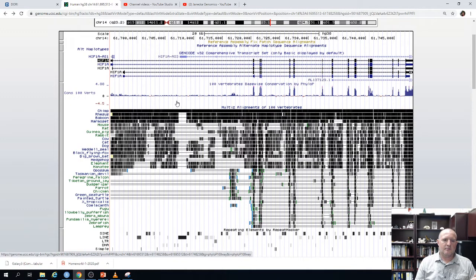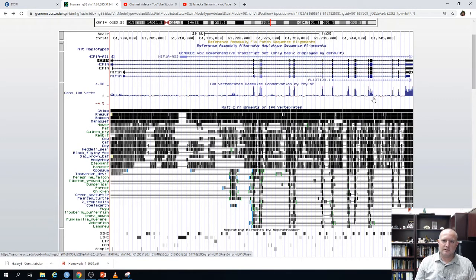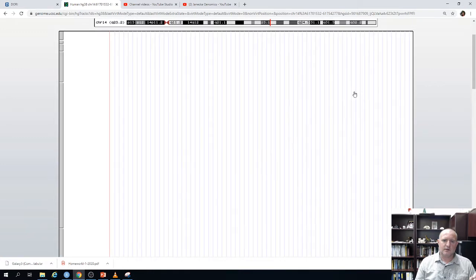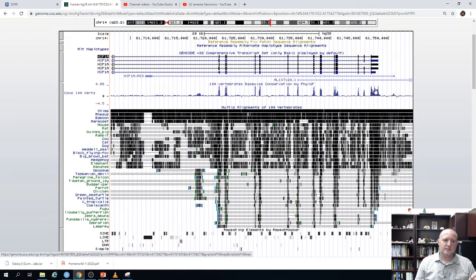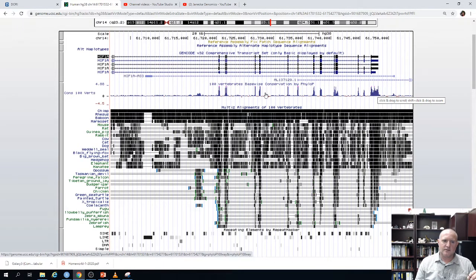You can see by looking at the pattern across this gene that the more conserved regions match up almost perfectly with the positions of the exons — because exons are functional, they're going to be more conserved across different species. You can also see that the untranslated regions are typically not as conserved; the peak heights aren't as high as for the exons.